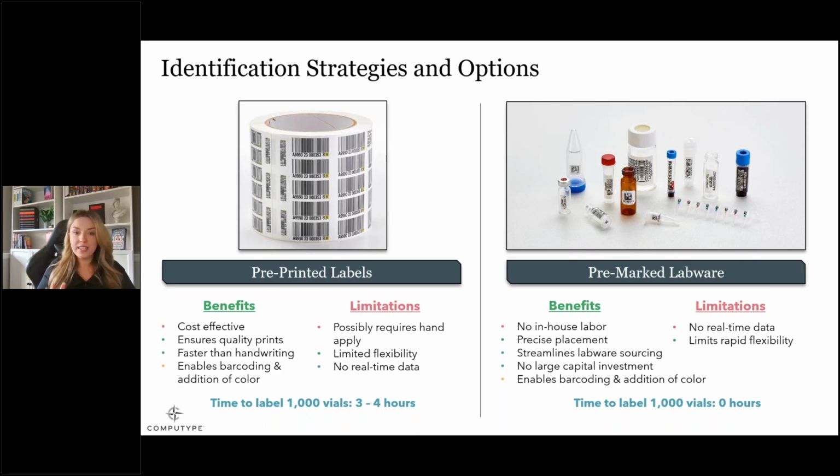And when you're considering these options, don't think you're limited to just one. We see plenty of labs use multiple of these methods in different parts of their workflow, or even combine methods to get the best results. I previously worked in a lab where I was accessioning samples for clinical trials focused on childhood oncology, and we were solely printing on demand because we received real-time data, but this data was also sensitive patient information that couldn't be seen outside of our laboratory.